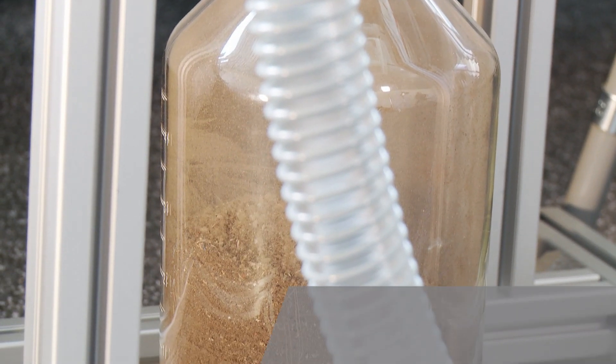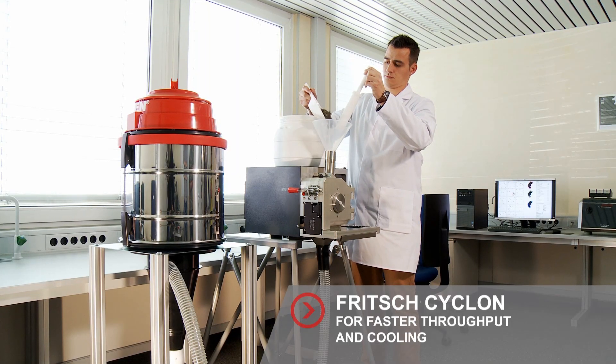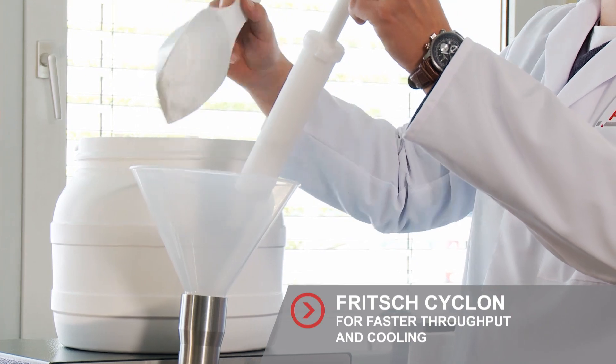Work even faster with a Fritsch sample exhaustor with cyclone separator. The sample is aspirated with negative pressure. The advantage: an even faster throughput and good cooling.